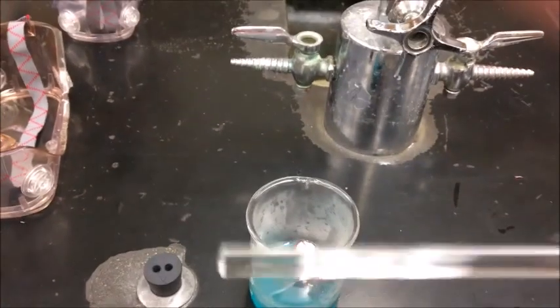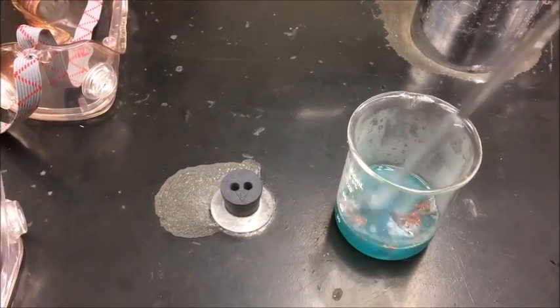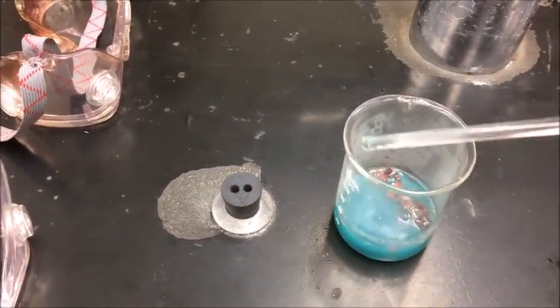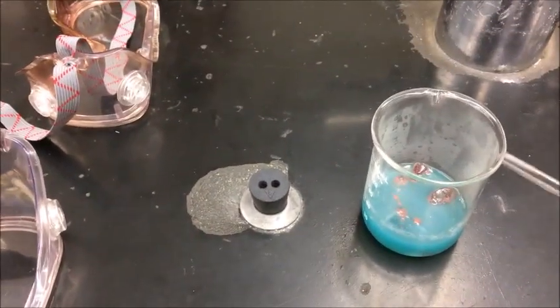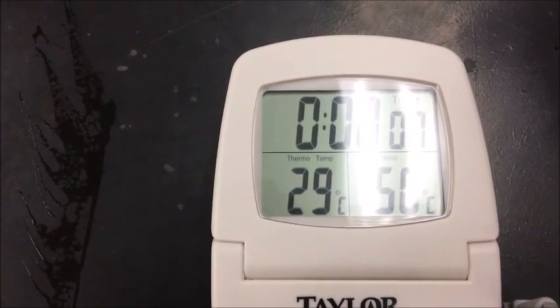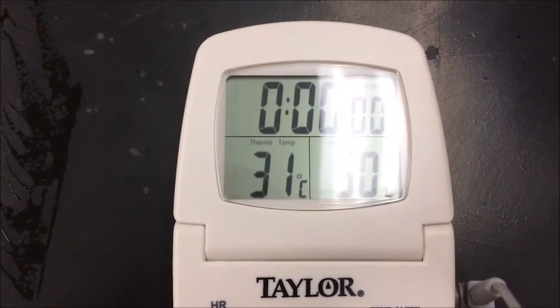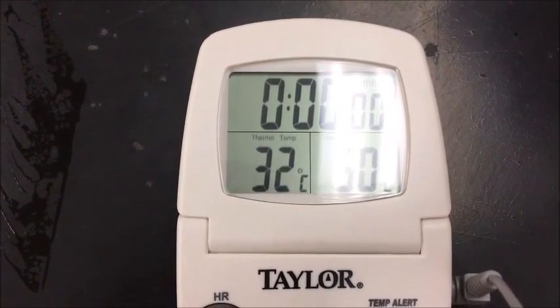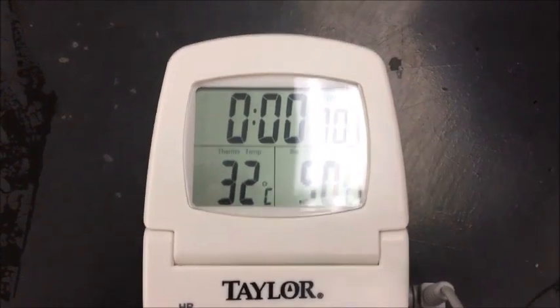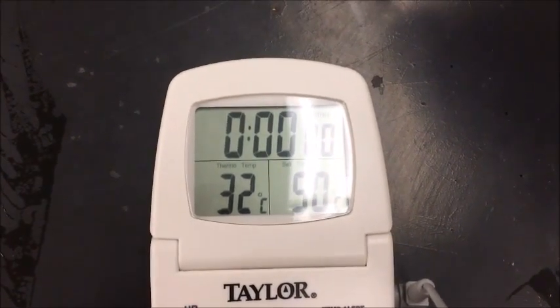You can take the glass stirring rod and you can mix it, and then we'll take a temperature again and see the temperature has changed in the copper chloride. Notice that it's gone up significantly from the first temperature reading I gave before I put the aluminum foil in the liquid — so it's 32 degrees Celsius.